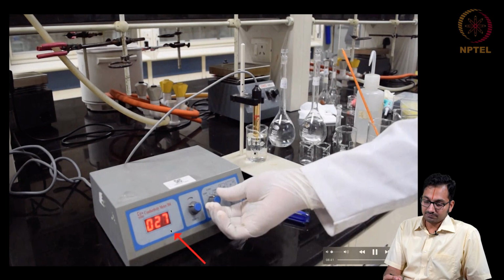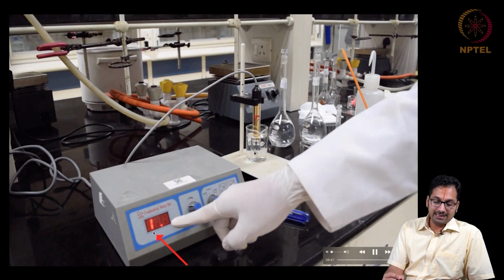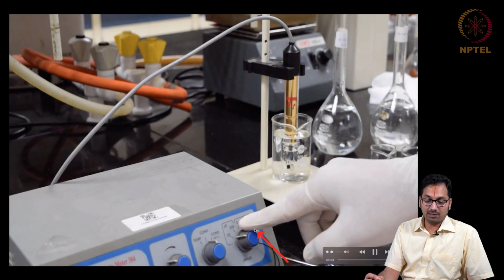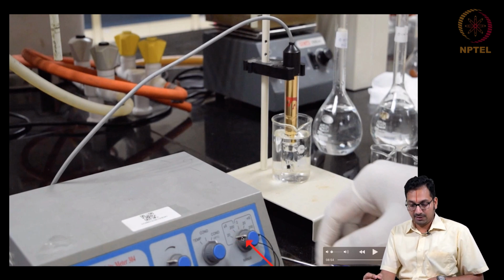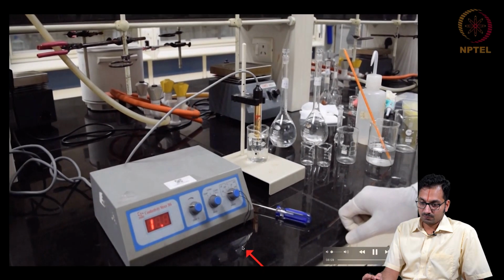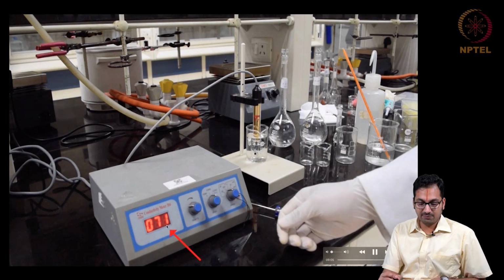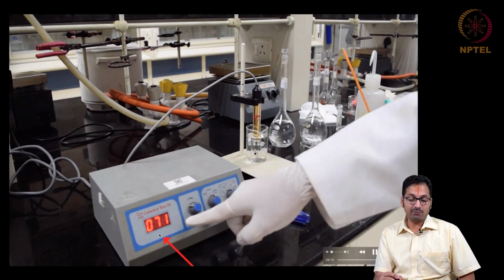Once that is done, he changes it to conductometric measurements, and he realizes that he reads a value that does not make sense. So what he does is to change the least count at which he can measure. When the meter is kept at 20 microsiemens, you are actually not able to read anything. So he will change it higher to see whether some value comes off it. Just changing it from 20 to 200 microsiemens, immediately you are able to read a value, which is 71 microsiemens.